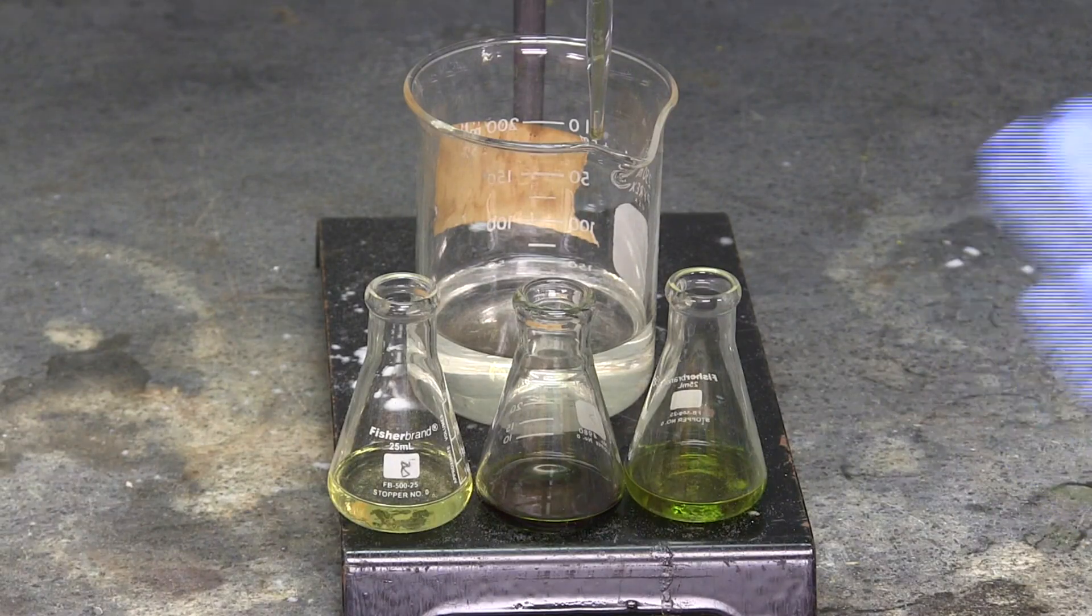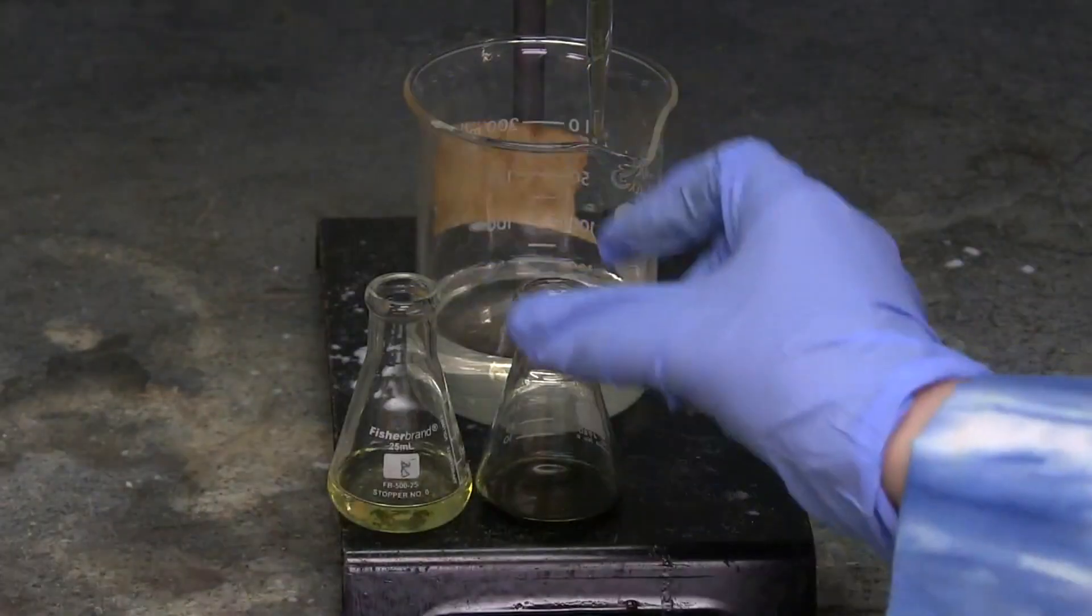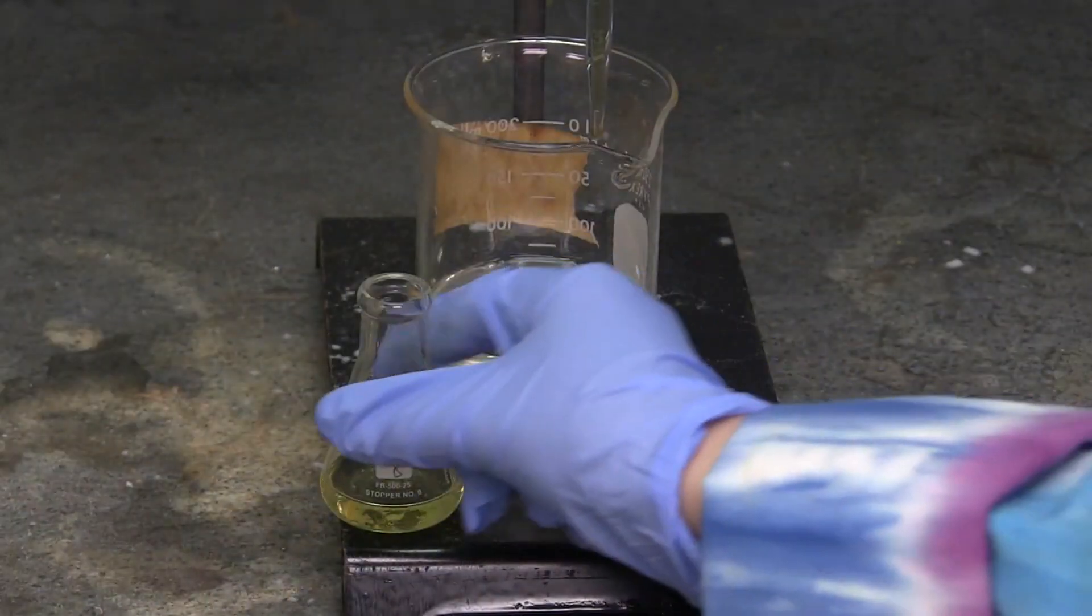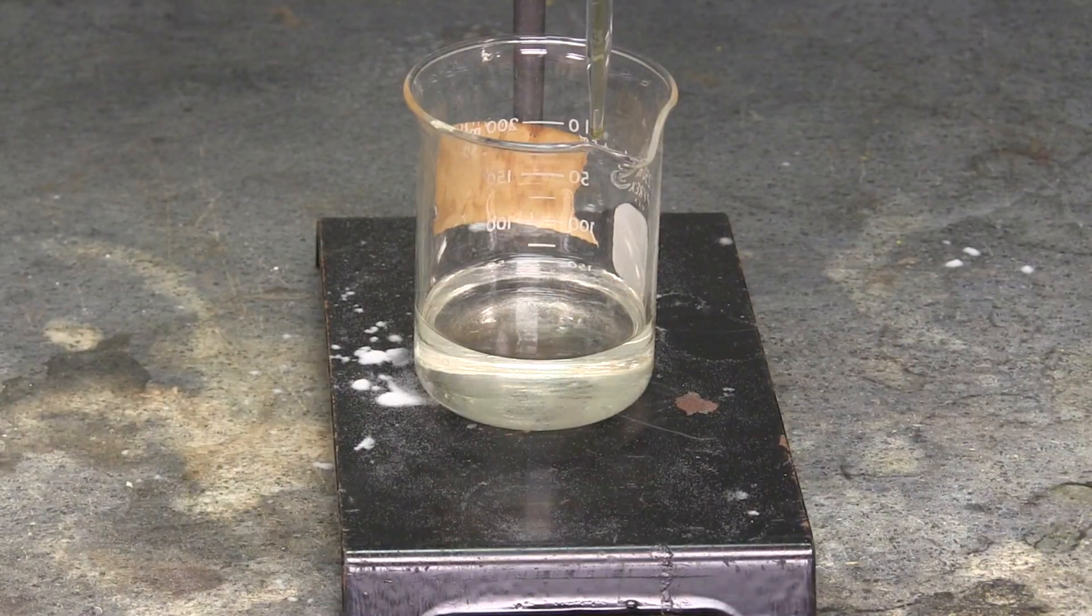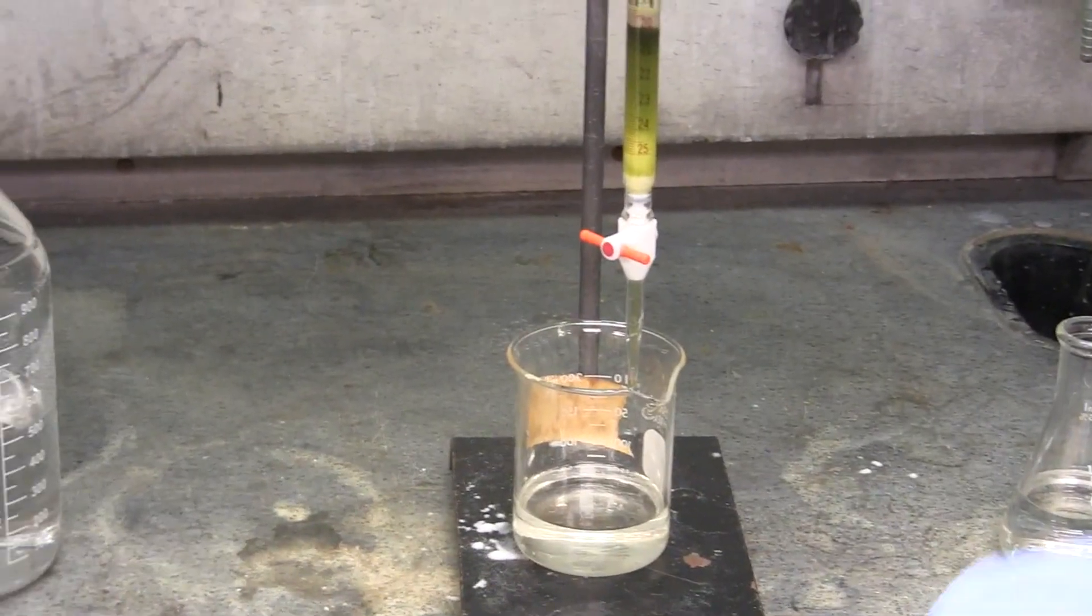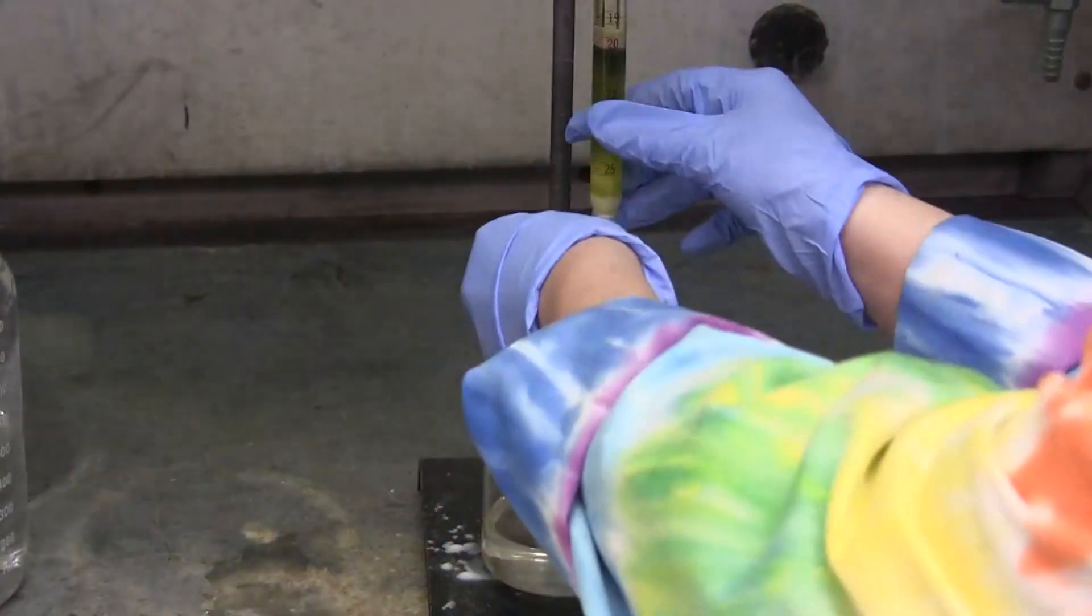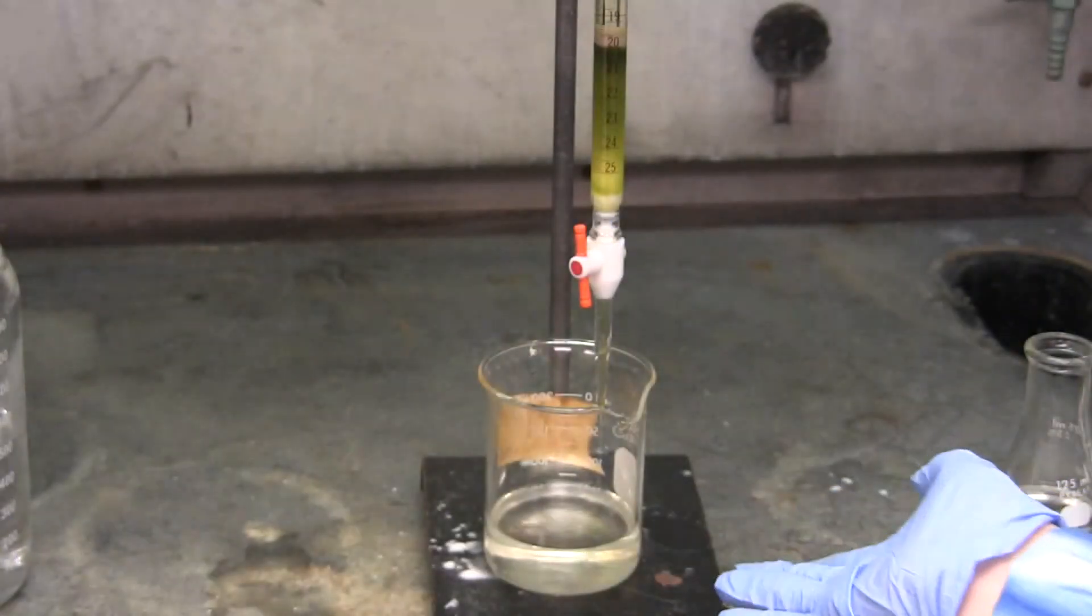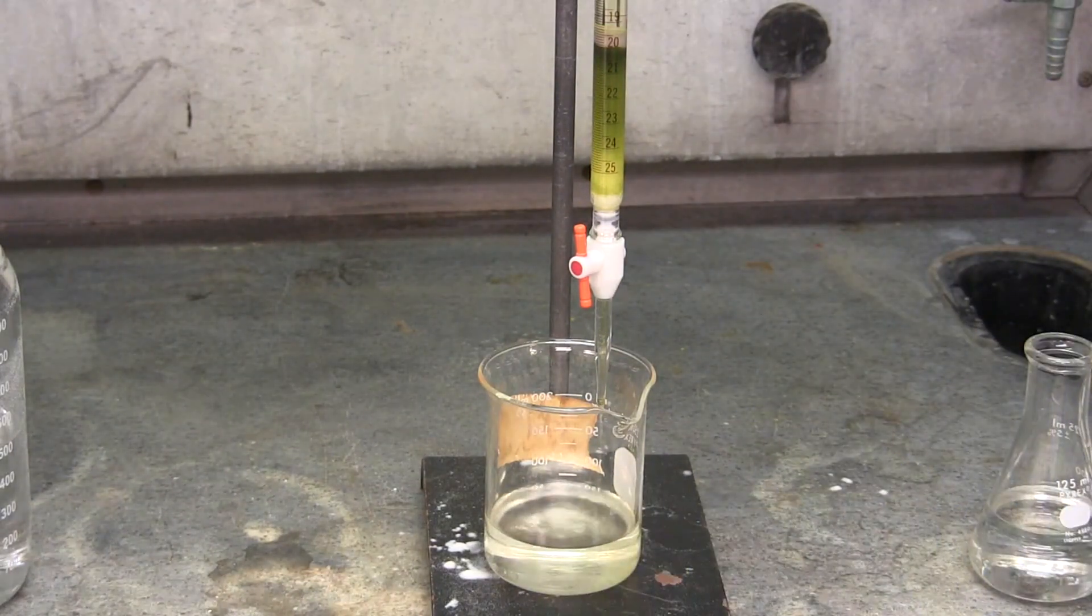The fractions will then be analyzed using TLC analysis. The column is then left open to drip into the waste beaker. The waste is then dumped into the proper waste beakers and the TA will take care of cleaning the column and putting away the column setup.